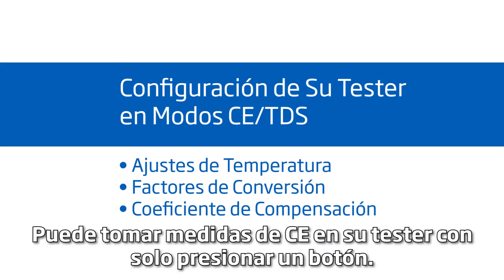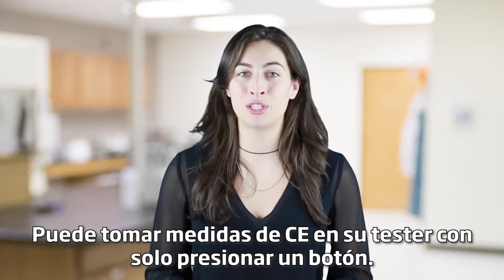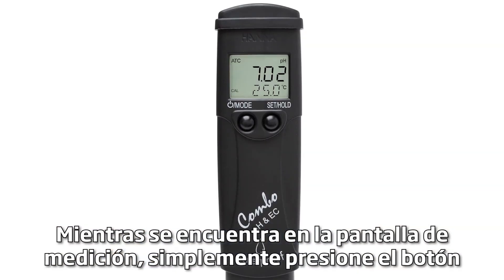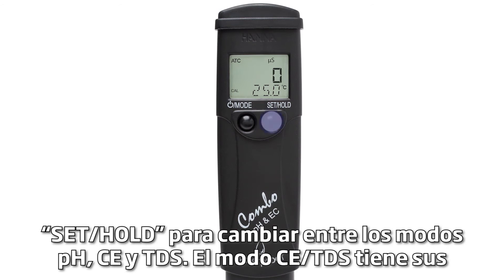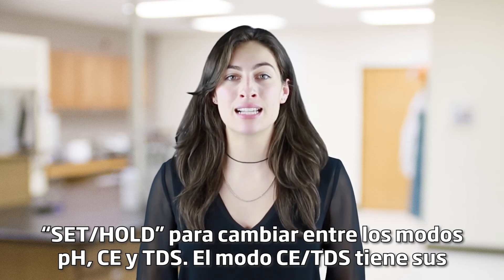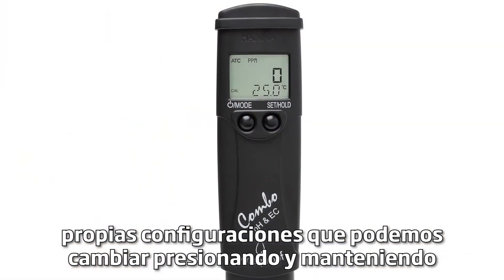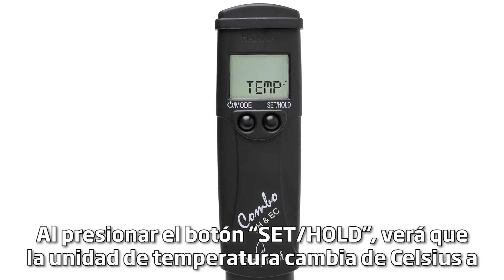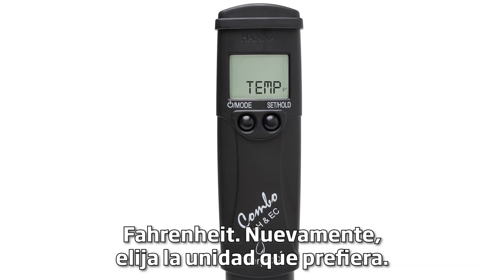You can take EC measurements on your tester with a push of a button. While on the measurement screen, simply press the SET HOLD button to switch between pH, EC, and TDS modes. EC/TDS mode has its own settings that we can change by pressing and holding the MODE button until 'temp' shows on your screen. By pressing the SET HOLD button, you will see the temperature units change from Celsius to Fahrenheit.